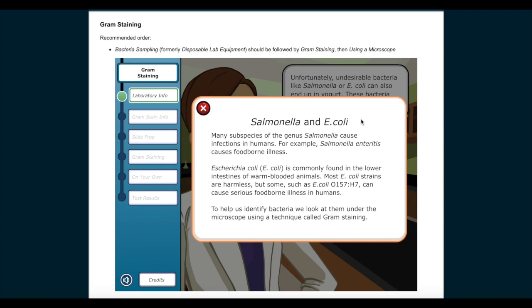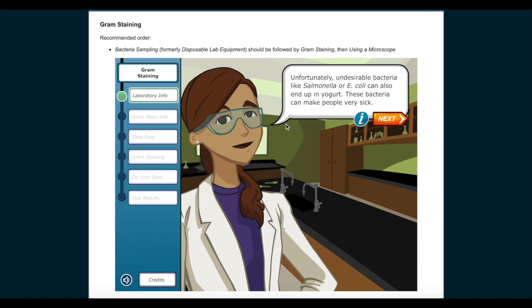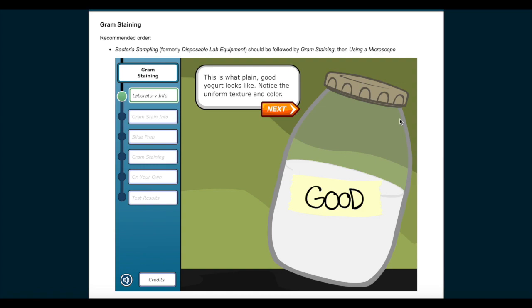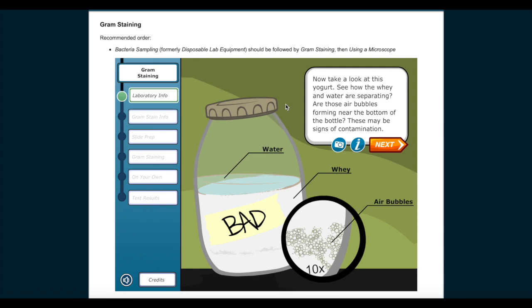To help us identify bacteria, we look at them under the microscope using a technique called Gram staining. This is what plain, good yogurt looks like. Notice the uniform texture and color. Now take a look at this yogurt. See how the whey and water are separating? Are those air bubbles forming near the bottom of the bottle? These may be signs of contamination.